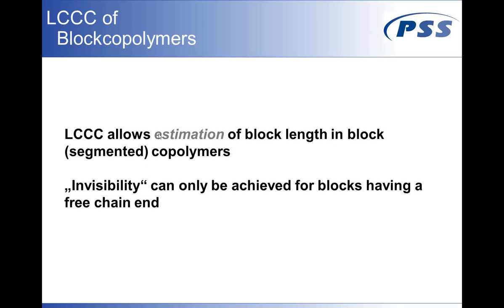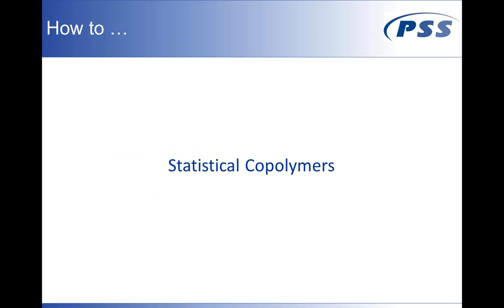And I always write estimation here because under certain conditions you might also see a tiny effect of the non-visible block. That is still an ongoing discussion, but at least you get a better insight into the block length of the block copolymer in these molecules.